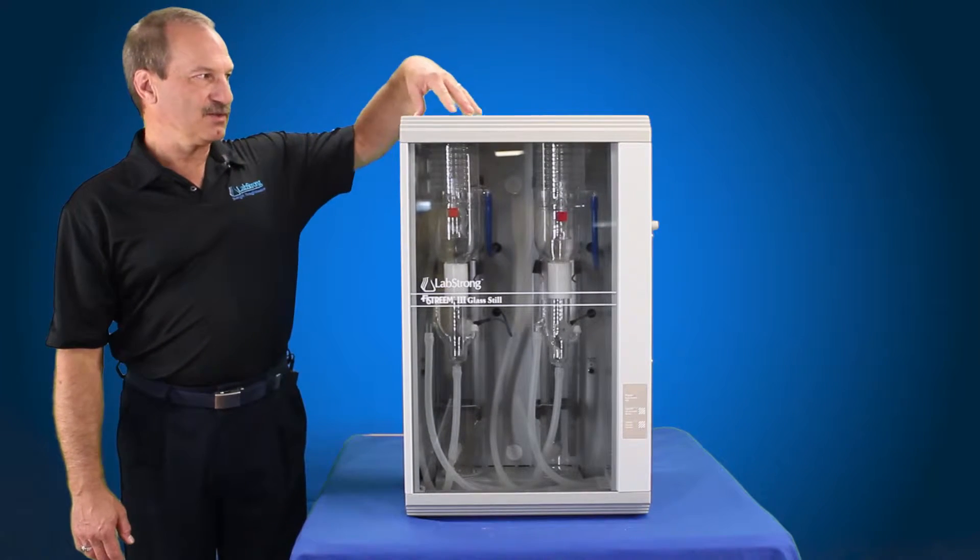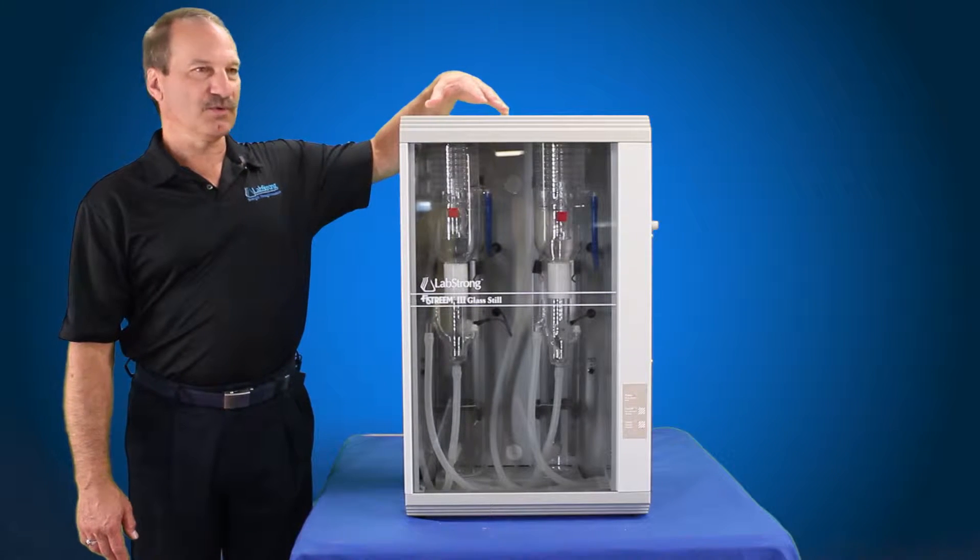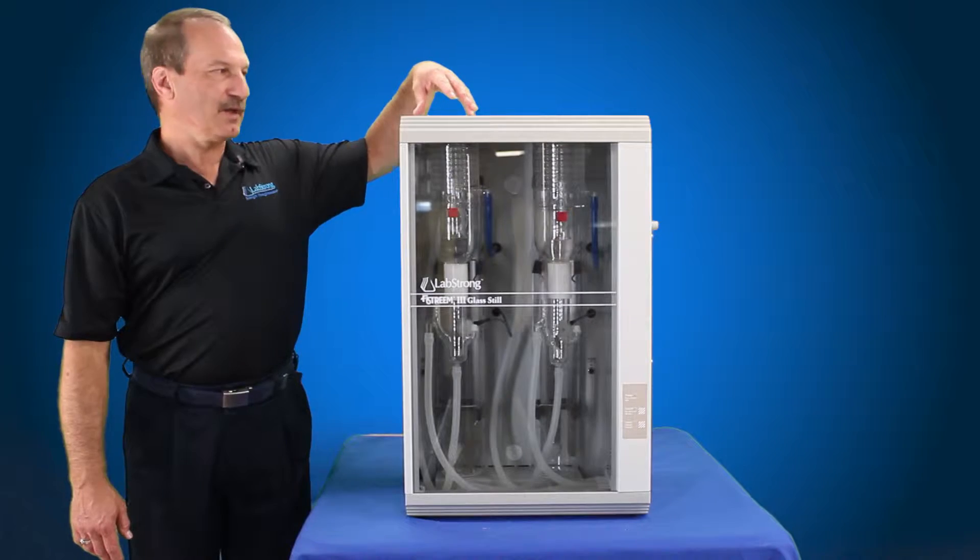It's just that one has two double boilers — a double boiler system — whereas the 5-Stream 3 4-liter per hour system has just a single boiler.